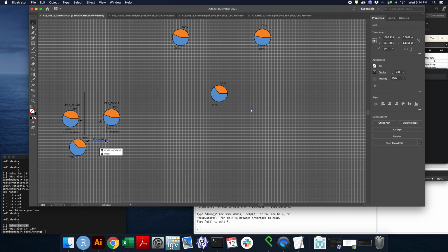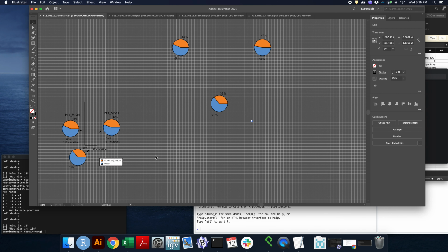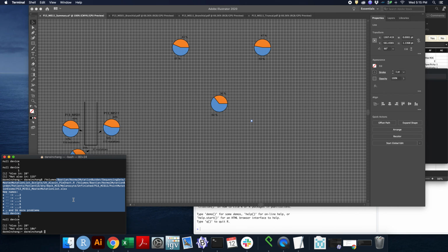Obviously, depending on the tree, it could be a varying size because sometimes there are more than just like 100 mutations or something. If you get 1,000 mutations, you have to scale a little bit differently. And if you only have a few, like if you're using UCSF 500 only, then you will need to have probably a larger scale. But it's a good basis to start off of.